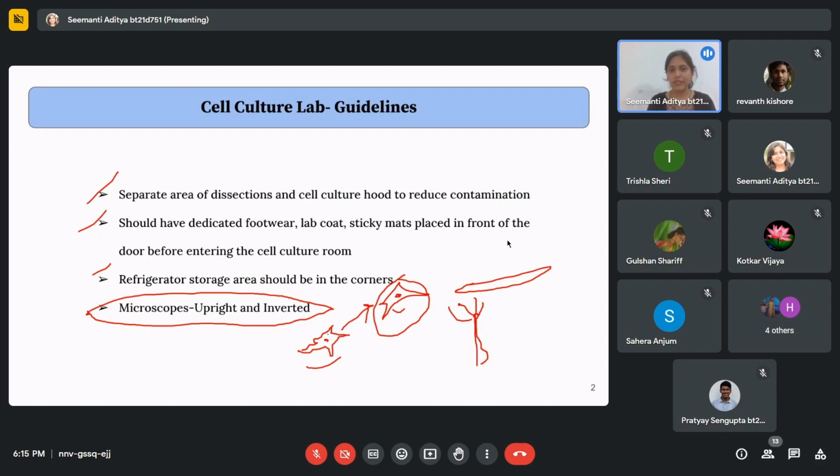So contamination, when we are seeing it in the microscope, it is very difficult to observe mycoplasma contamination because mycoplasmas are very small and we cannot detect them with our naked eyes. So we have to take the cell culture dishes and do real-time PCR with mycoplasma genes, the genes which are present in mycoplasma, and we have to use primers against those genes so that if we are having mycoplasma, then those primers will bind to the mycoplasma genes and will give an amplification, and we can figure out whether there is mycoplasma contamination or not.